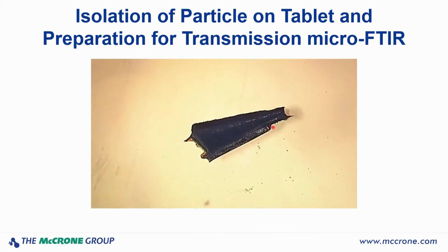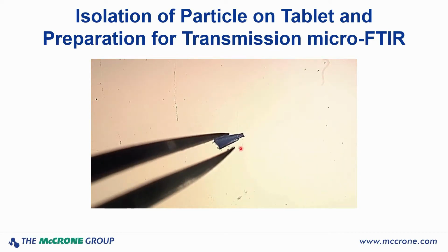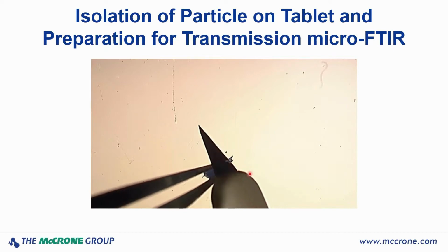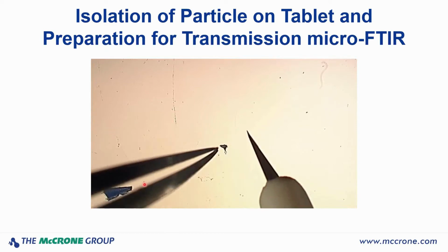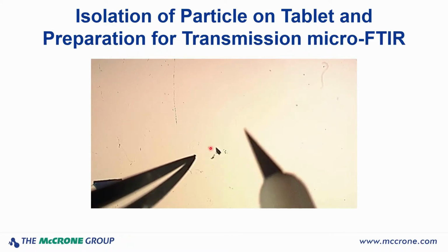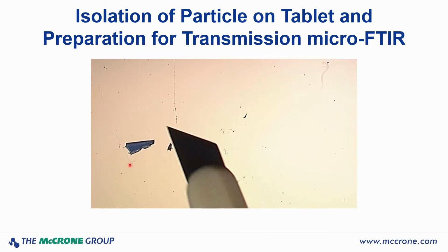I'm rotating it because I know that I want it in this orientation for my correct hand positions for sampling that particle. No way we could analyze that particle whole. So there's my microscalpel. We're going to cut just a little small sample off the tip of that. We're going to save this for later in case we need it. I know that sample is way too large for what I'm aiming for, so we're going to cut off about 80% of that sample. We're going to take it and move it back over here, so we've got it to come back to later if we need it.